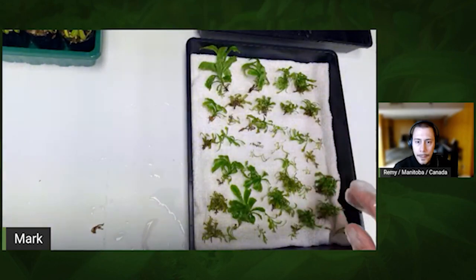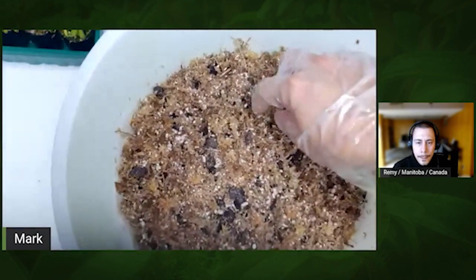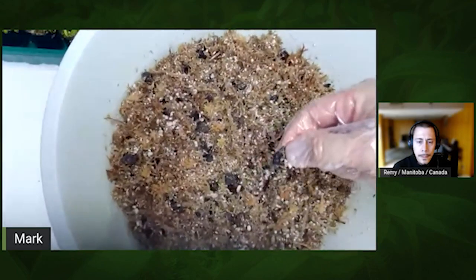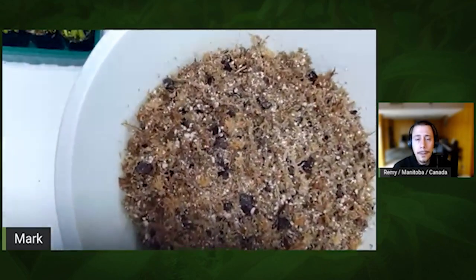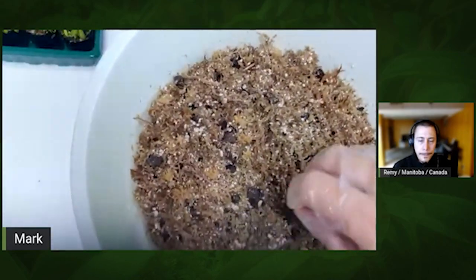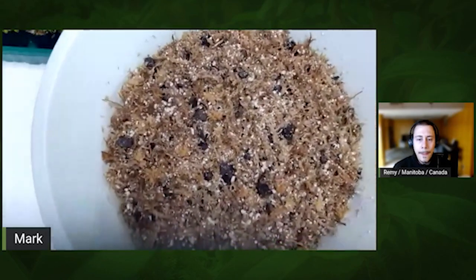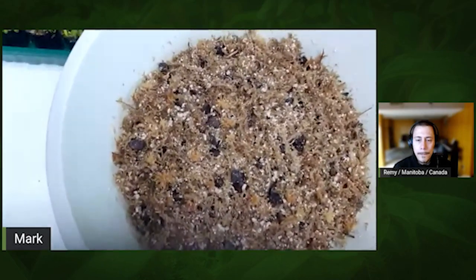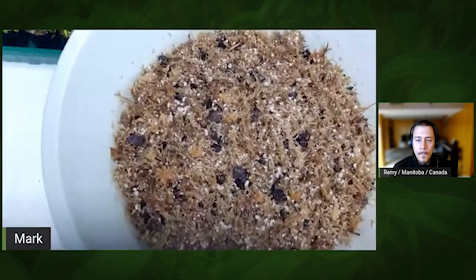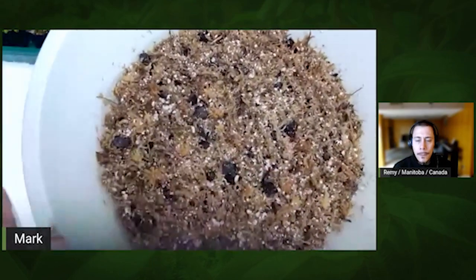Now I need to clean them well and repot them. Here is my potting mix — it's a bit of sphagnum moss, perlite, and a little bit of orchid bark. Before we start, I already microwaved it for two minutes so it's sterile. If you don't microwave it, there's a big chance of algae spores, fungus, pest eggs, or anything. Microwaving eliminates all these issues, especially because the plants will be inside a dome at 100% humidity for six weeks where anything can happen.